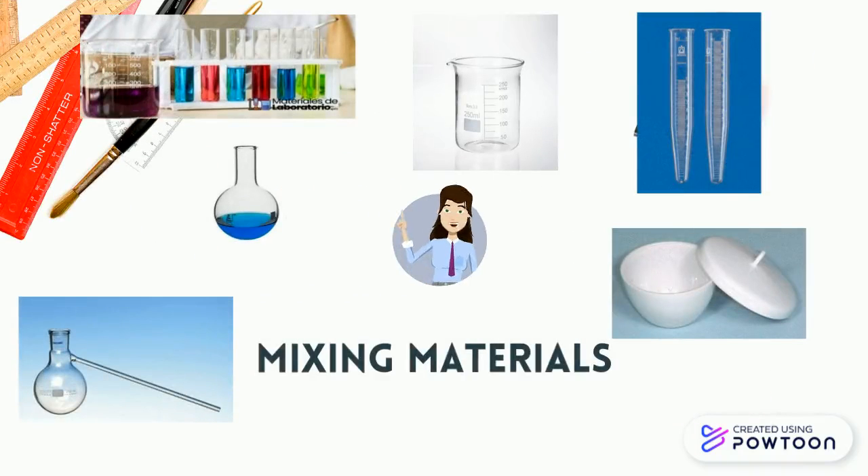Over there you see the beaker — it is used to receive filtered preferred solutions. And also you see there are flasks, and there are glass containers to carry out various chemical reactions. The crucible is used for heating at high temperatures, such as drying or calcinating a substance.